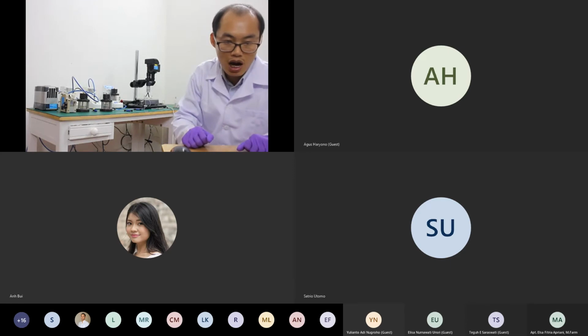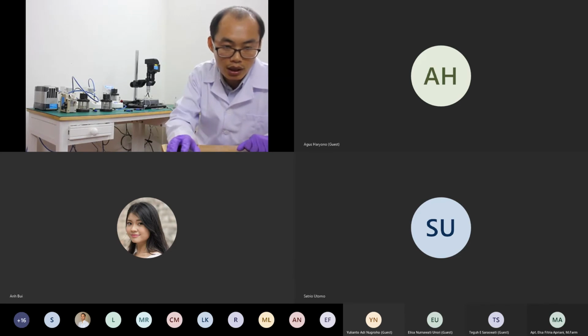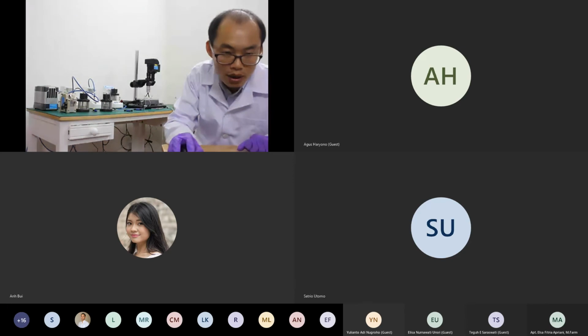How big is the diameter of the fluid channels? And it's made by glass. Is it possible if we use a dispersion, or an already made emulsion or other fluid emulsion?